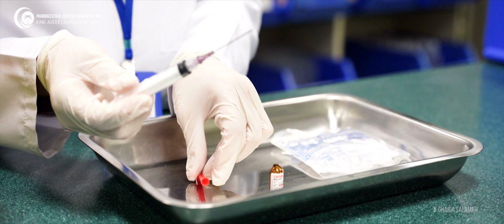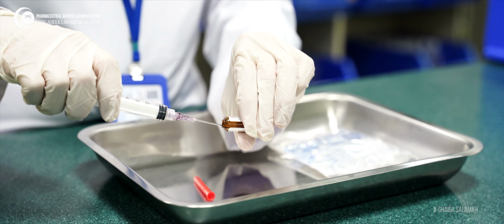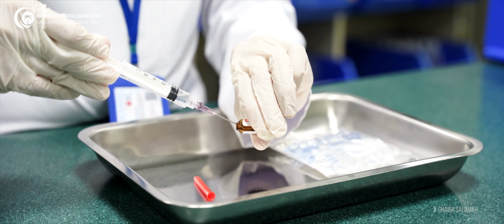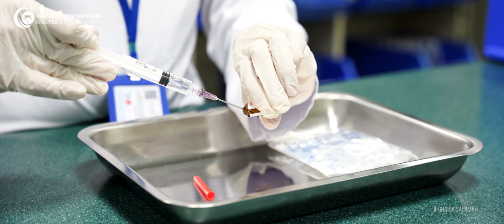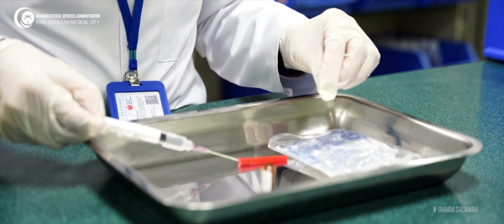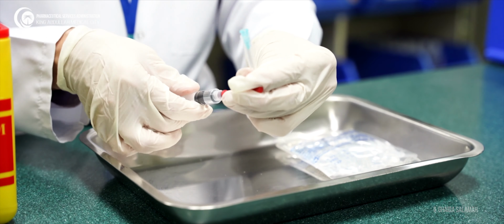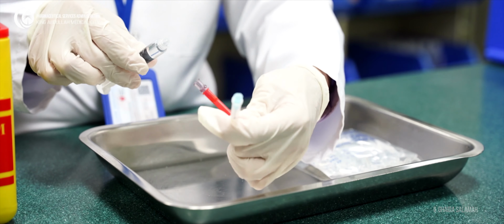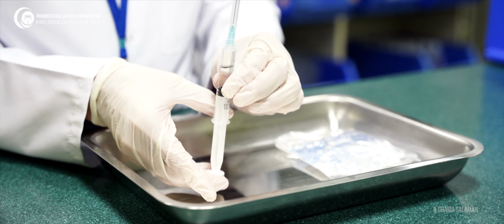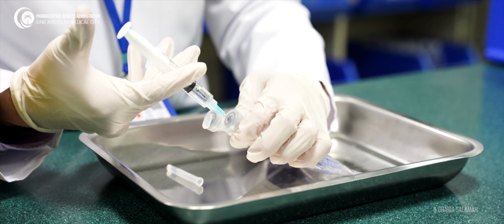Then withdraw with the syringe attached to the filter needle. Then try to hold the ampule at an angle, like 45 degrees, to make sure all the liquid is down and you can withdraw all the volume. Then after you withdraw, you will discard the ampule. Also, you should change the filter needle to a regular needle. Then after you adjust the volume you want, you will transfer it to the bag.